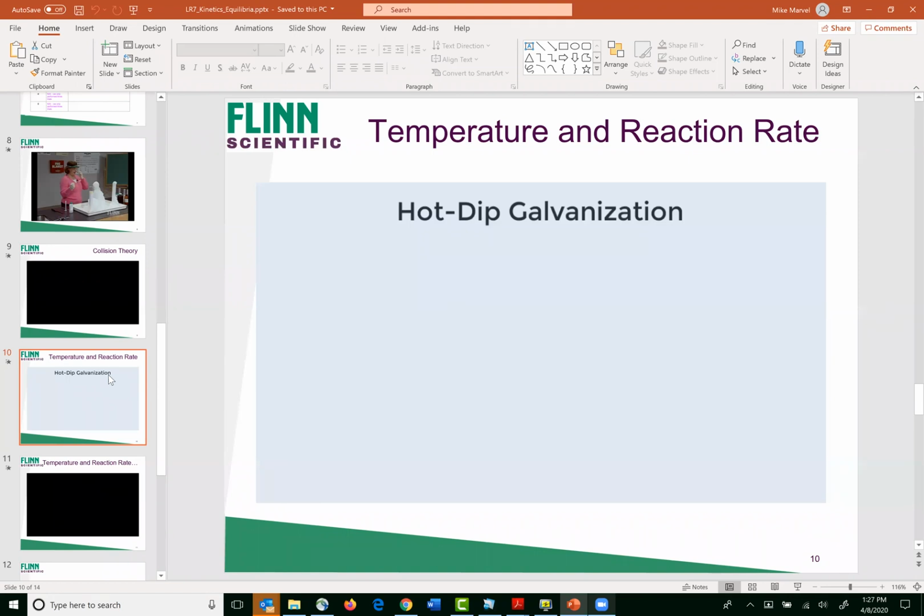Hey, Mike, while we're waiting the last 5-10 seconds here, can you give a quick definition of what galvanization is? Oh yeah, galvanization is coating a metal with another metal, and particularly it often applies to amalgams or alloys. When you have different metals, for example, copper and nickel, and you're trying to get them to come together or galvanize, you have to heat them. So that's the process you just saw there. We're coating the penny in another metal by virtue of heating it.